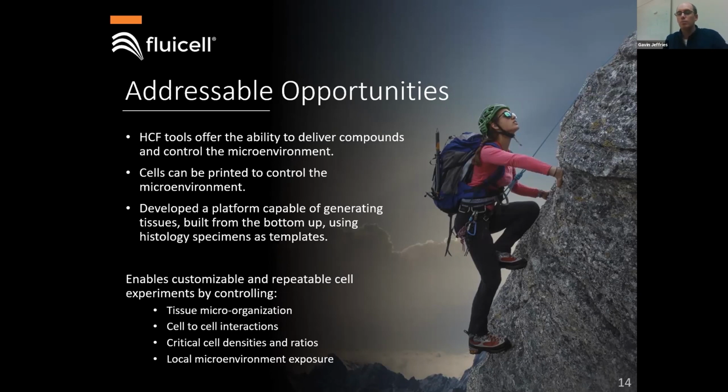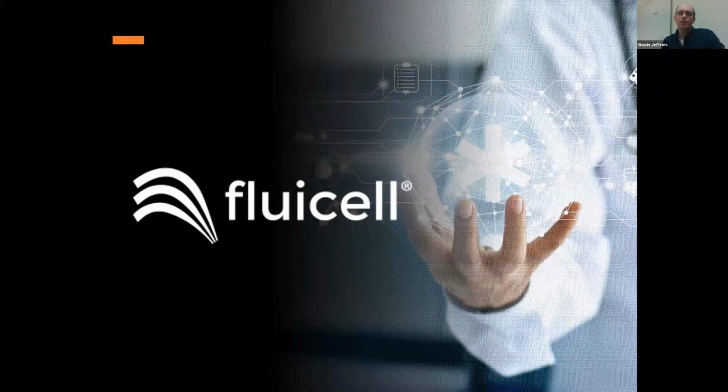And also, because we are still founded on this solution exchange, we can then go to these tissue systems and directly control the microenvironment using the solution exposure system. So, with that, I will wrap up and stop sharing, and I will be open for any questions.